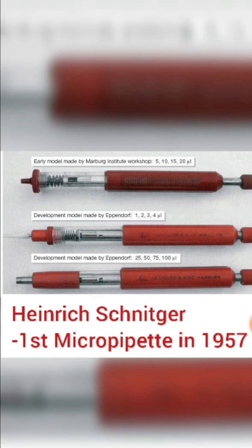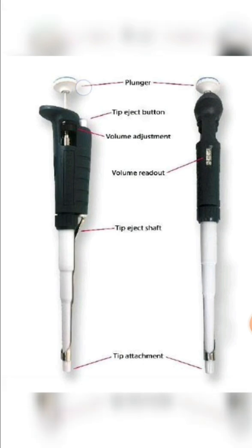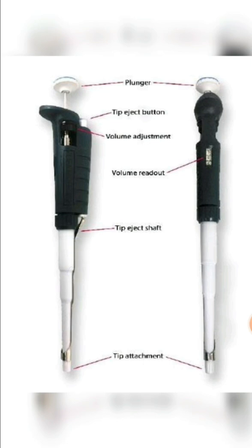This is today's modern micropipette. The plunger is used to uptake and release the exact volume. Pipette tips are attached at the bottom, allowing us to uptake the required amount of volume by pressing the plunger. To release into another container, press the plunger again. After uptake and release, the pipette tip is ejected using the tip ejector button, and a tip eject shaft releases or discards the pipette tips.